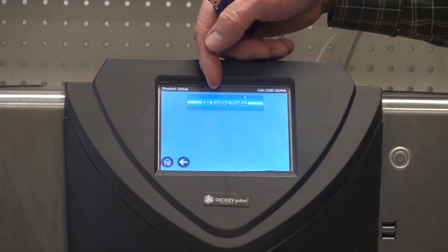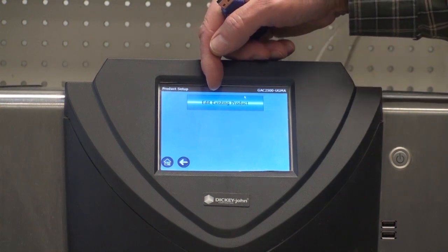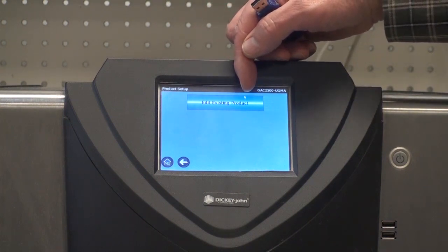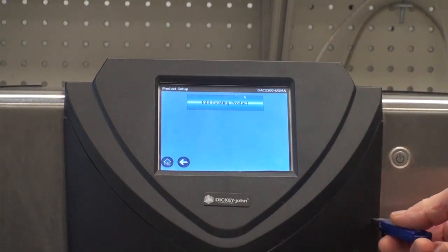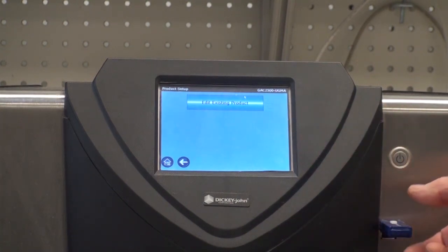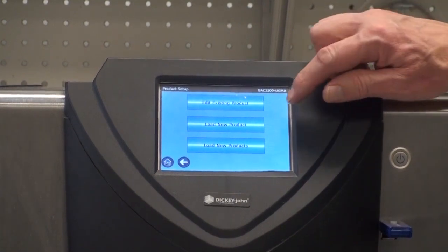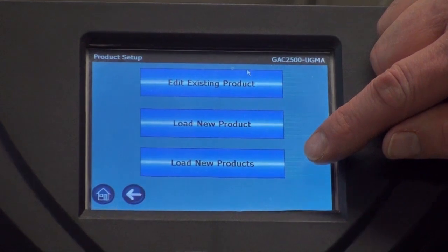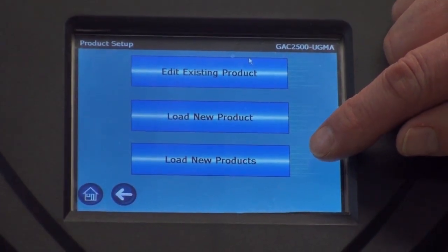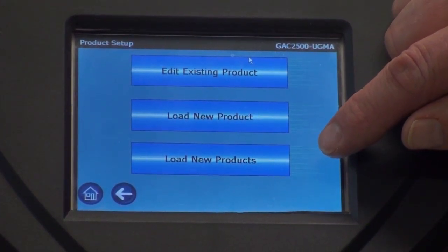You will now see a single button labeled edit existing product. When I insert the USB you will see two more buttons come up on the screen: one of them is load new product, for a single product, and the other one is to load multiple products, labeled load new products.